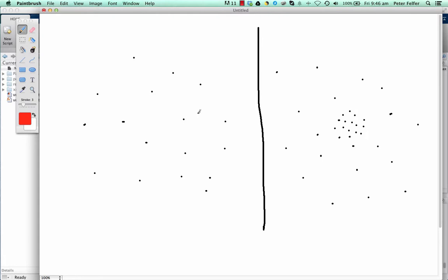The Voronoi clustering program came out of the simple thought that clustering analysis should be easy and should be really a one-click process where the algorithms behind the program actually do all the work for you. You need a spatial filter where you don't need to start tweaking things or optimizing things by hand, but you need something that actually gives you a good answer straight away.